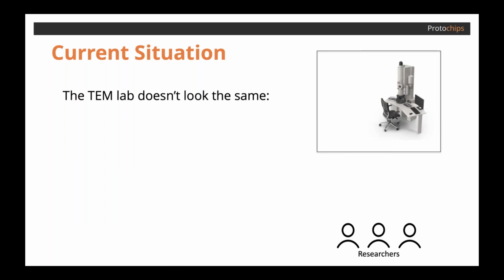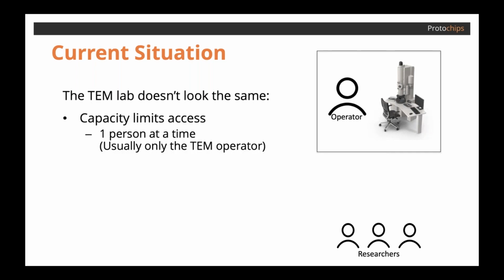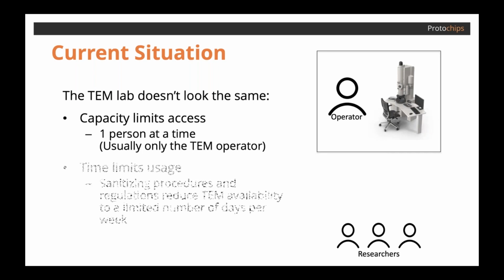The TEM lab also does not look the same. Universities and industry alike have had to adapt to this new normal filled with distancing and remote activities and an insane amount of virtual meetings. So it's no surprise that the TEM labs have made their appropriate adjustments to keep people safe as well. We're hearing a lot from our customer base that there are capacity limits, reducing the number of occupants allowed in the lab a lot of times down to only one, which would have to be the TEM operator by themselves. Those with more lenient capacity restrictions are still not allowing outside visitors on site.